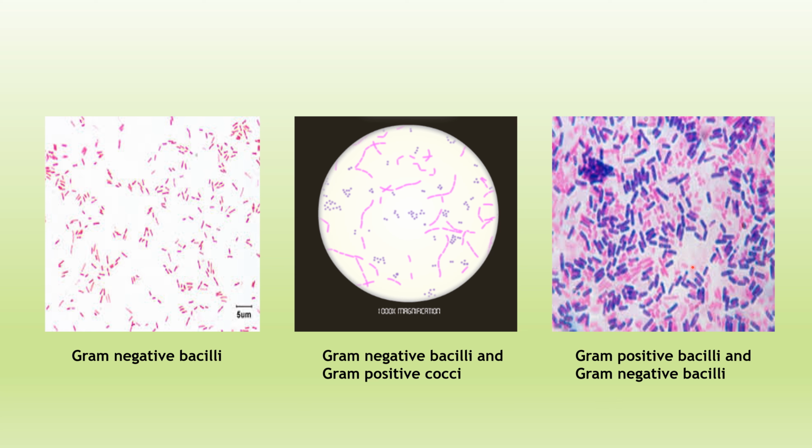So like this we are able to observe under the microscope. When you perform the Gram stain, you can observe images like this under the microscope. This is the 100x lens where you can observe the clear cut shape and also the clear cut color intensity of these Gram positive and Gram negative organisms. Like this we are able to distinguish.